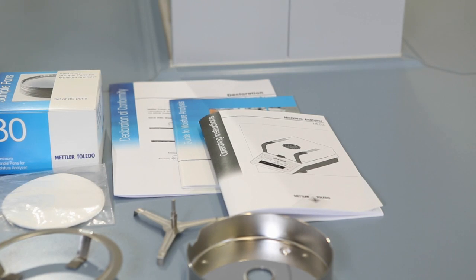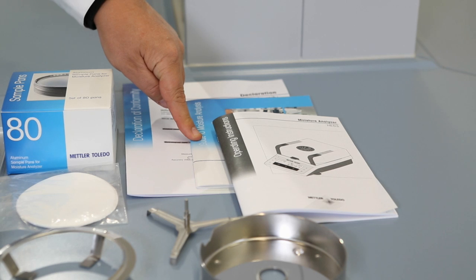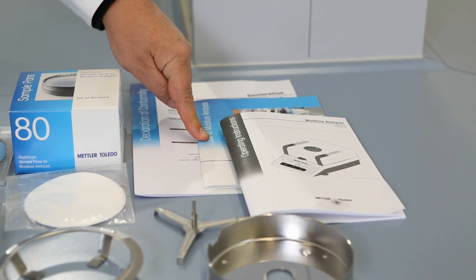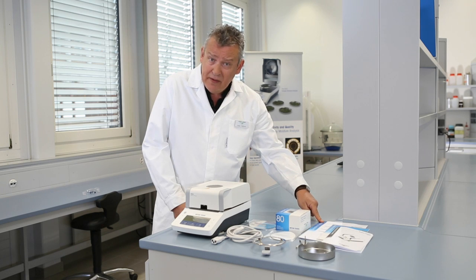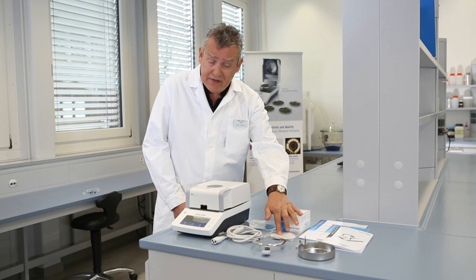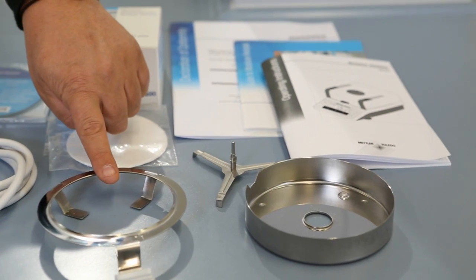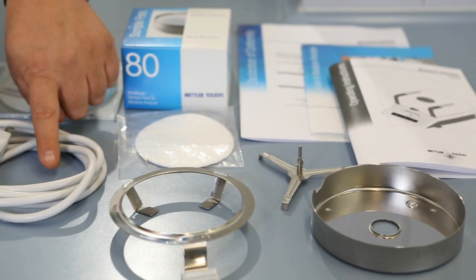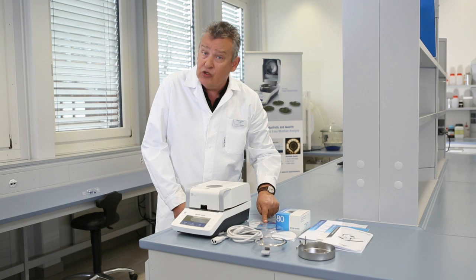The packaging contains the following components: the operating instructions; a moisture guide containing useful information and know-how about moisture analysis; a CE declaration of conformity; a box of aluminium sample pans; filter papers; a draft shield; a sample pan holder; a sample handler; a power cable; and a CD containing documentation in many languages, as well as SOPs for routine testing, and of course, this installation video.